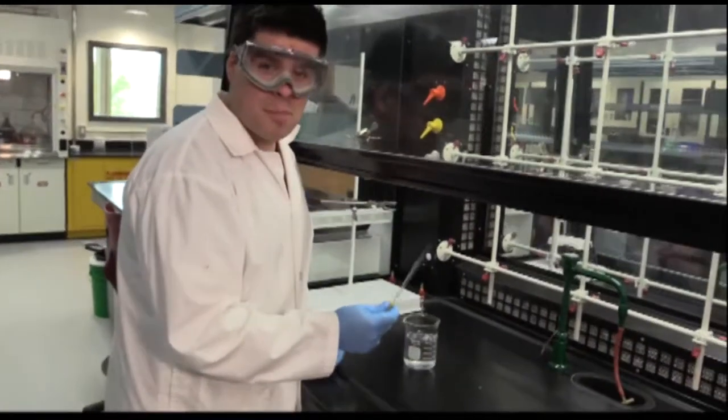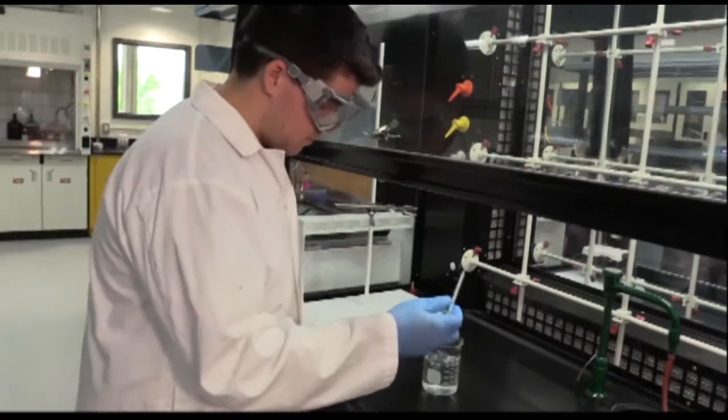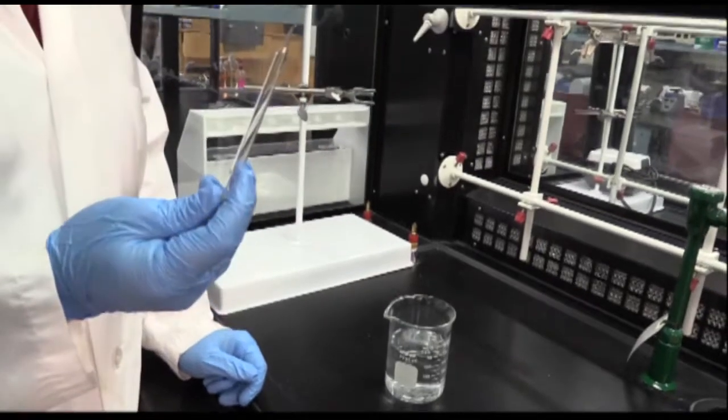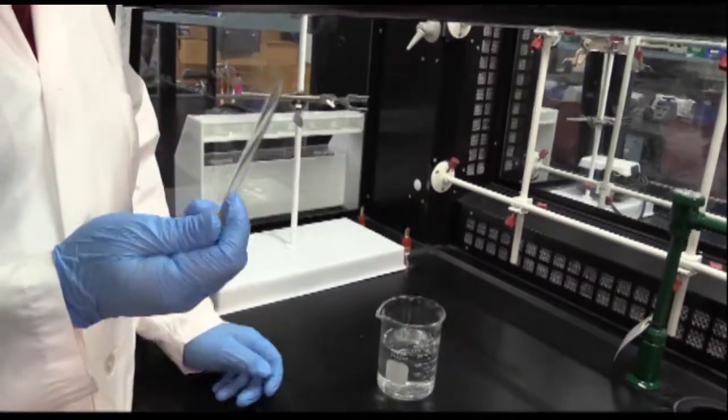In this experiment, we'll be using a pasteur pipette. Oh, shoot. I broke it. I don't want to get in trouble. I better hide this.